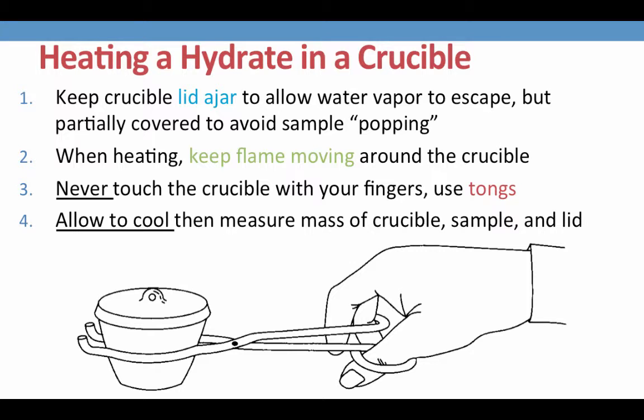Once again, I want to remind you to allow your crucible to fully cool before measuring its mass. Whether you choose to measure the mass of the crucible with or without its lid is not important, so long as you are consistent each time that you weigh it. If at the start of the experiment you included the lid, then continue to include the lid throughout. It's also a good idea to always use the same balance throughout your experiment.